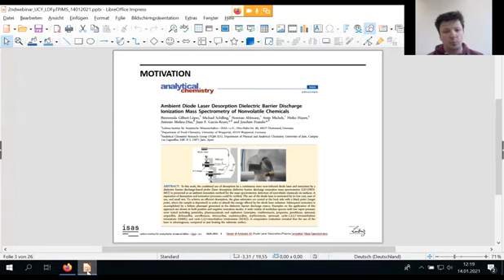There were some issues with that technique, because the ink dot depends on the manufacturer and the solvents you're using, as well as the droplet that can spread all over the glass surface. So you're not able to confine it. That was really the starting point where I thought, okay, maybe we can have some improvements in here to make it a little more reproducible.